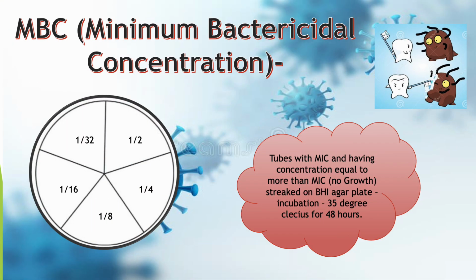Last but not least, in order to protect our teeth from the cariogenic bacteria, Streptococcus mutans, we performed one more test known as the MBC, minimum bactericidal concentration. Scientifically, the MBC was determined subsequently using the broth dilutions from the MIC test. After identifying the MIC, samples with concentrations equal to or higher than the MIC were streaked on a brain-heart infusion, that is a BHI agar plate, divided into compartments.